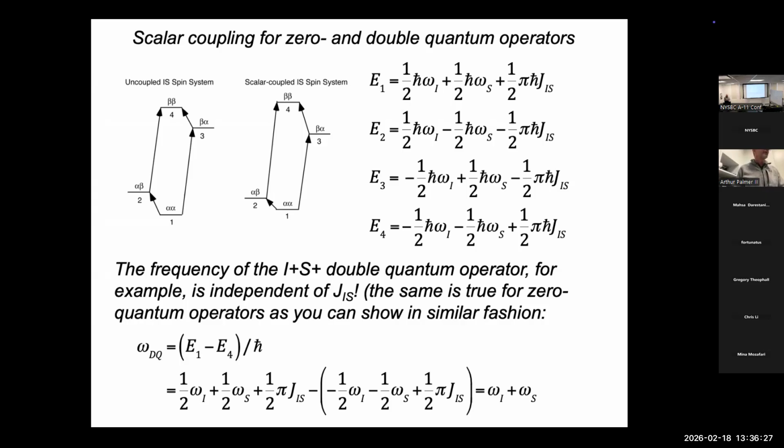In the case of, so you'll do that in the problem set. That's kind of an extreme example because they're so different. In carbons, the scalar couplings between a carbon and the attached hydrogens depend on whether it's methine, methylene, or methyl. So the number of hydrogens attached to a given carbon affects the coupling constant, and whether it's an aromatic carbon or not. So the couplings in a methyl group are about 125 hertz.